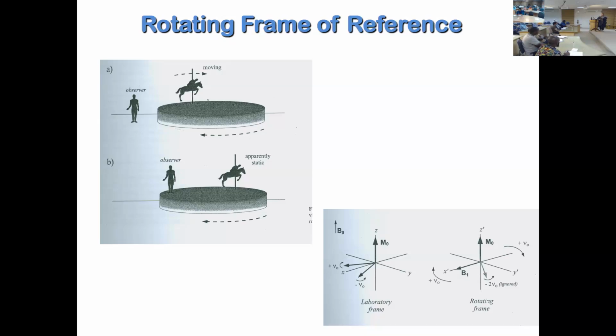Otherwise, if the detector is not moving and is just standing outside, suppose the detector is like a human being, so it is an eye, it's very, very fast. So it's nearly impossible to differentiate between the speed of two protons, right? We are talking about protons right now, but this is the case for each nuclei.